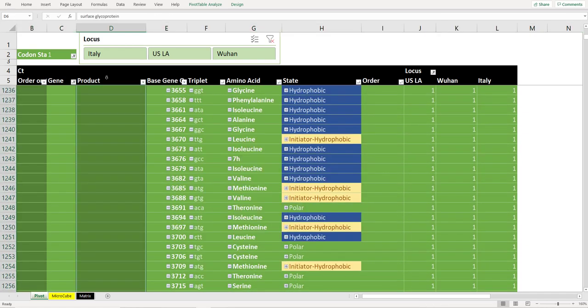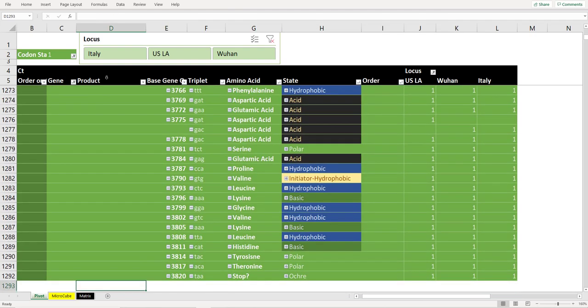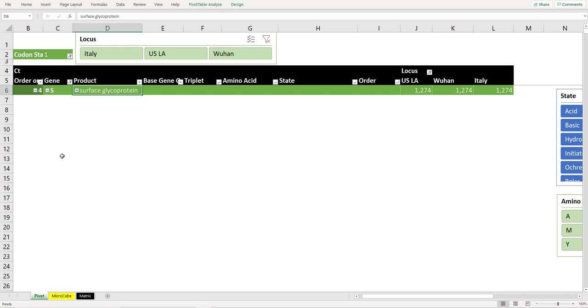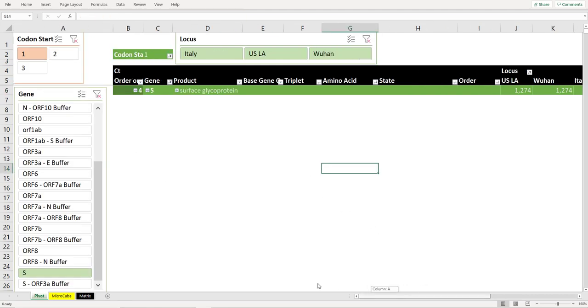So the point of all that was just a rudimentary review of the spike protein, right? The surface glycoprotein and comparisons from older versions to a newer version. It is quite easy to import new versions, and that's what I'm going to do over the next few days and really get an idea of what kind of changes we've seen in the Delta variant and how they compare to other things in the past, and then we will find out what's going on.